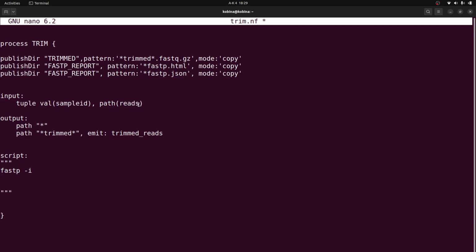Now this read here, we have read 1, read 2. And so you will say $ curly bracket reads 0, another curly bracket. So this represents read 1. Please take note of it. This represents read 1 because this is a list. We have 2 elements or 2 members in it.